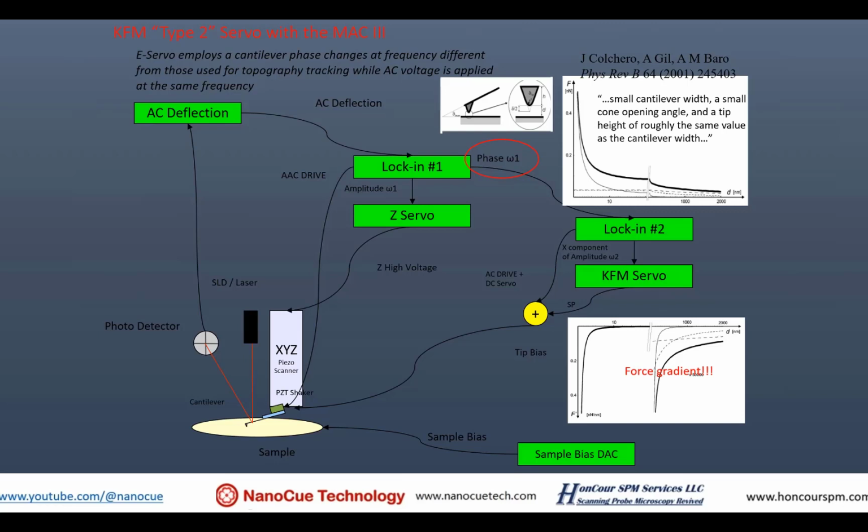Since Lucas Eng called this thing that was actually running on phase FM-KFM, we kept the same nomenclature, although I would have called it phase modulation instead of frequency modulation in both cases. Right. Because you see, the modulation of the primary resonant frequency is created by force gradient. It is modulated, but you actually don't lock onto it. You don't use a PLL. How fast is the PLL? Is it too slow to lock on?